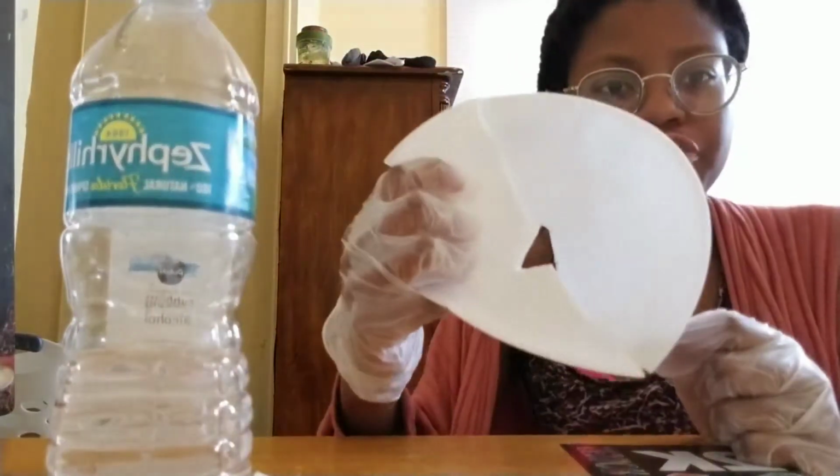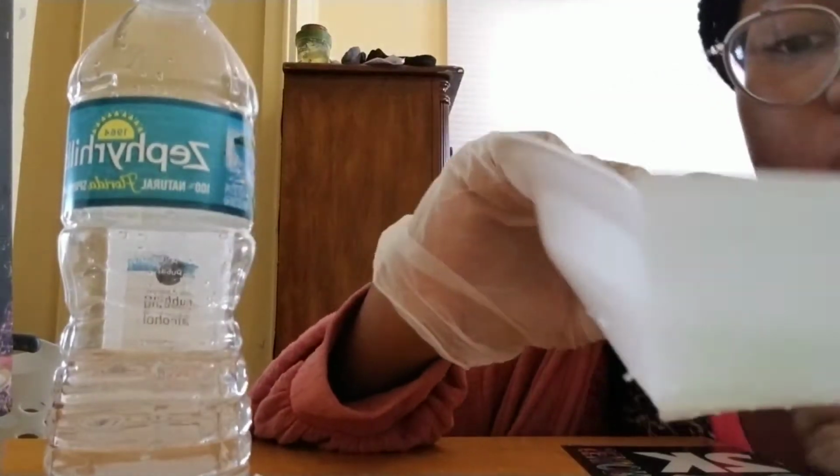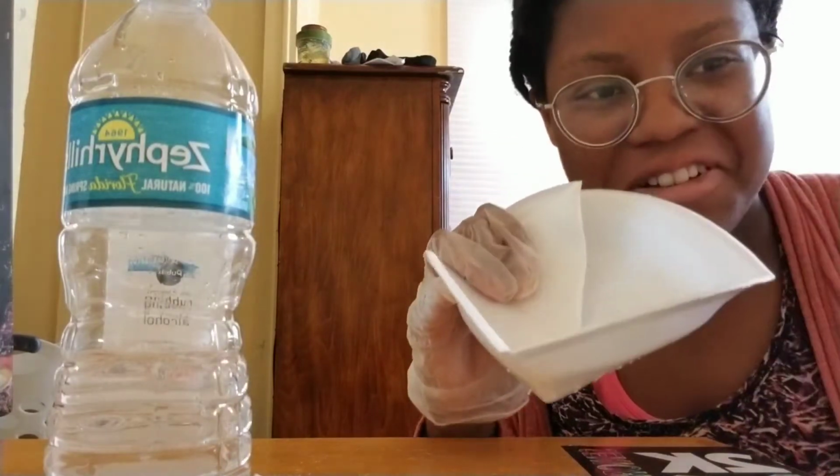Alright, this is our Buchner funnel. I don't know if you could see it, but there are holes on the bottom, and then it's like a little flat bowl shape. This is my best attempt at it.